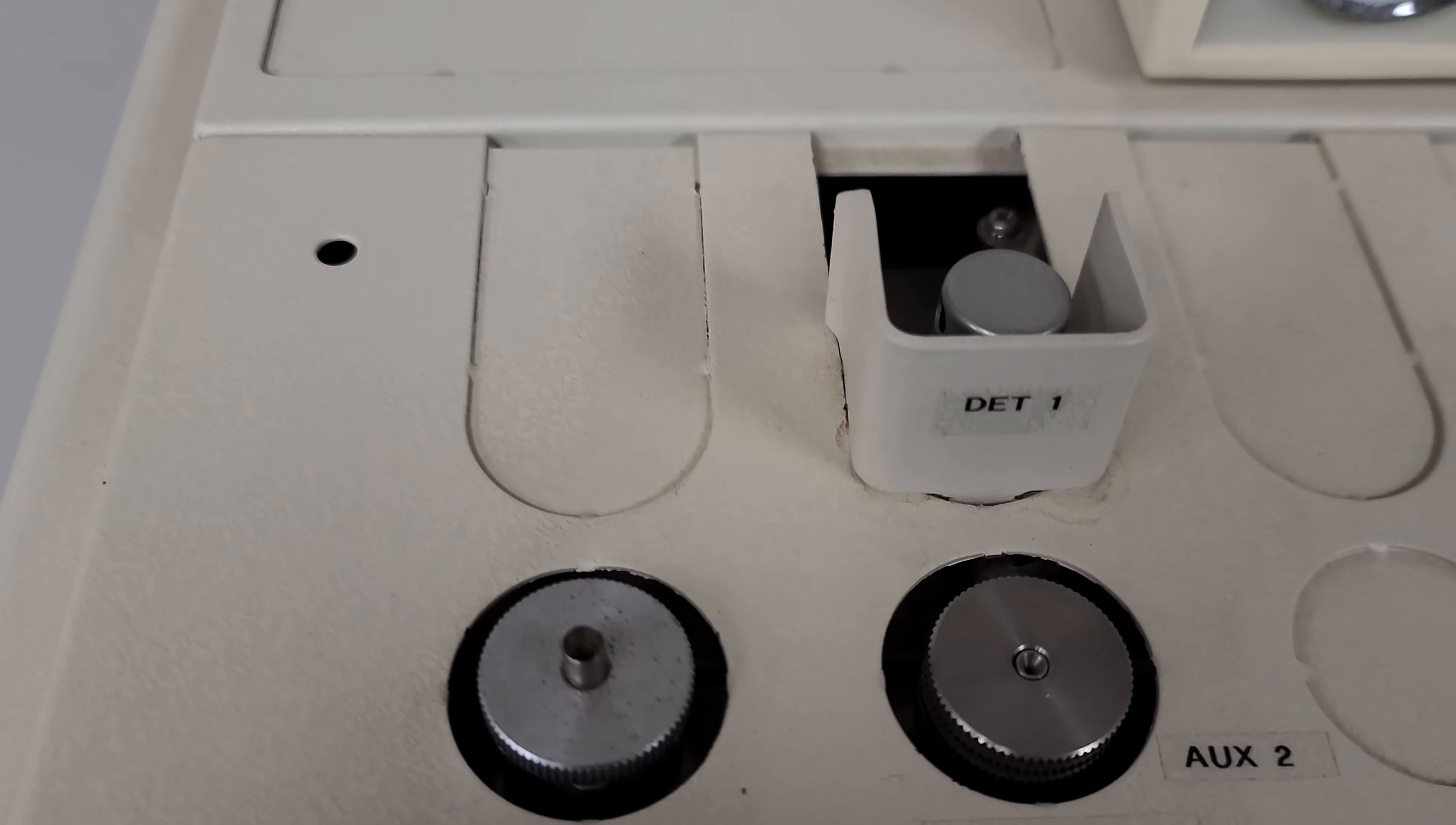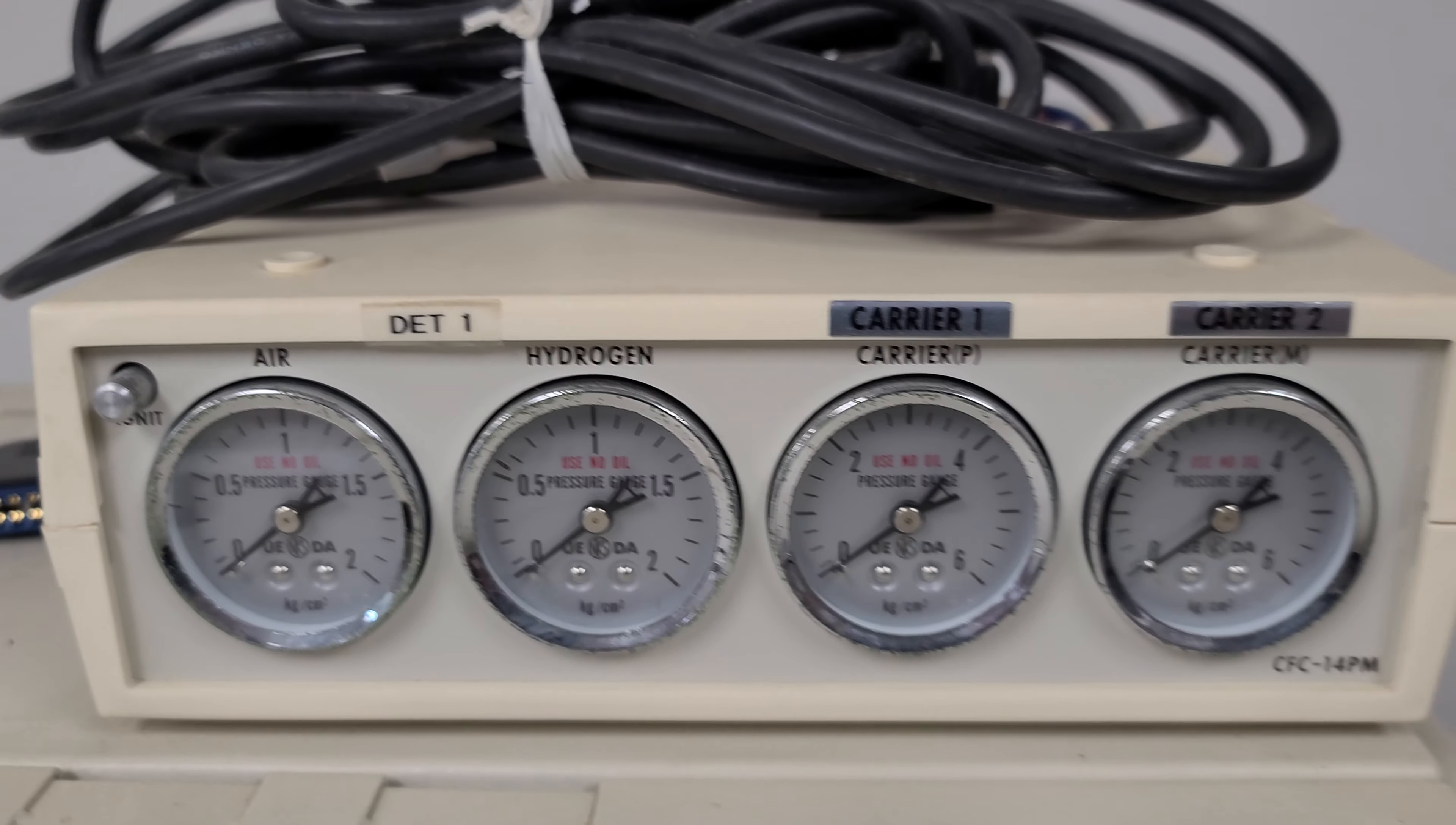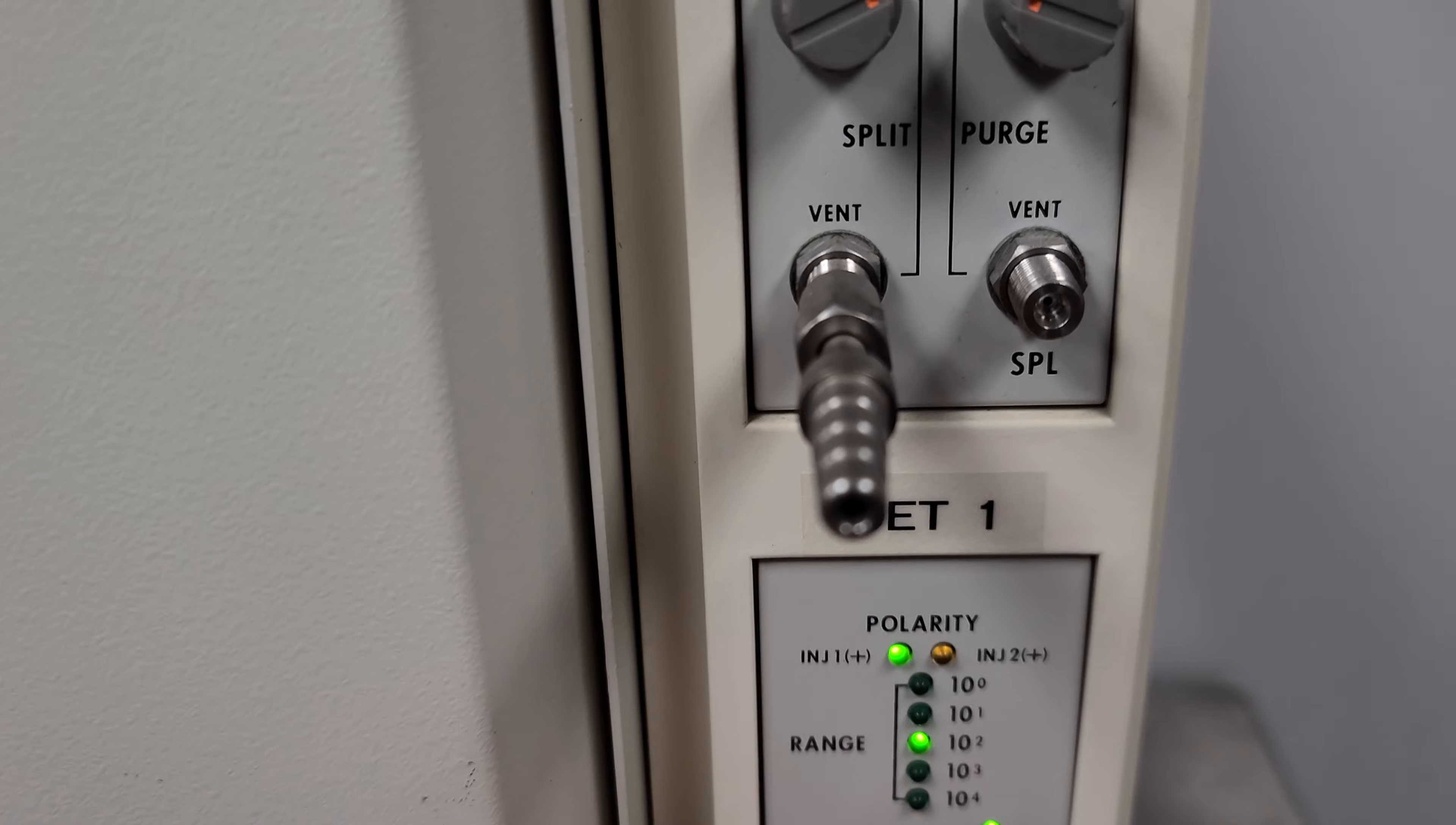Got some stuff up here. Looks like it's got some gauges: air, hydrogen, carrier, carrier, and some adjustment knobs on that side. It's got some lights.